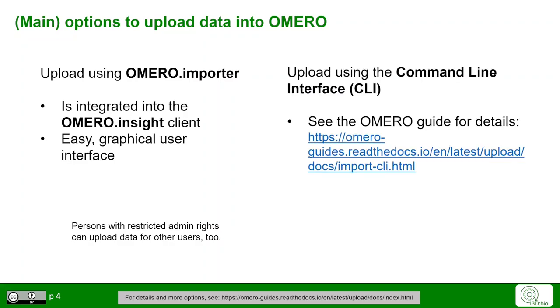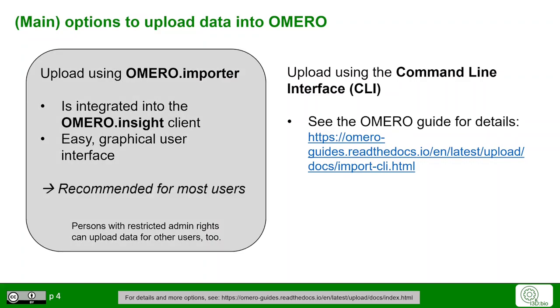Another option would be using the command line interface. For more details on this, see the Omero guides. For most users, we typically recommend using Omero Insight for data upload.